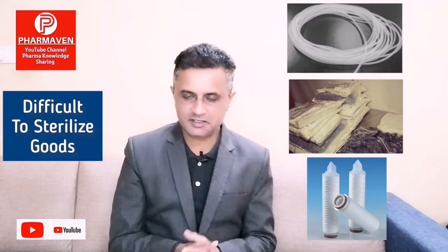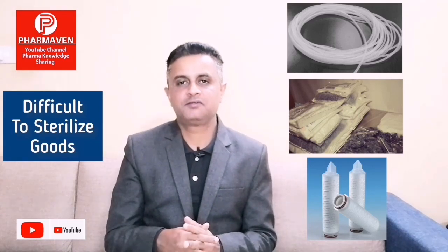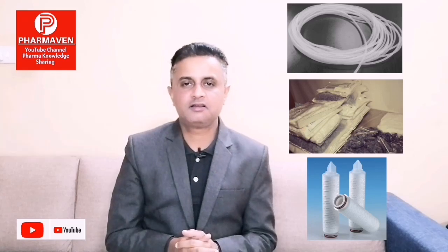However, in sterilization practices, to sterilize difficult to sterilize goods such as silicone tubing, filter housing, gowns, dense rubber stopper packs, filling assembly, the overkill cycle approach is usually adopted. In general, the microorganisms which are found in production area have the D value ranging from 0.5. So with 0.5, even with a 6 log reduction approach, even with 12 minutes of cycle, even with 6 minutes of cycle, it gets eliminated. But as an industrial practice, validation teams or sterilization experts, they prefer to go for the overkill approach cycle.